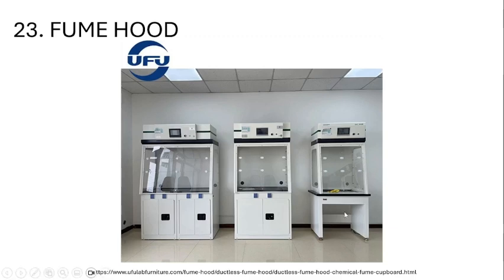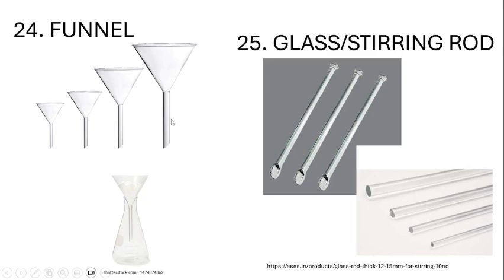Next is our funnel. If you're familiar, I think in Bisaya it's called embudo. This laboratory funnel is made of glass, but there are also plastic funnels. For experiments, we use the glass. It is a glass tube or pipe, with a conical top and a narrow tube at the bottom.